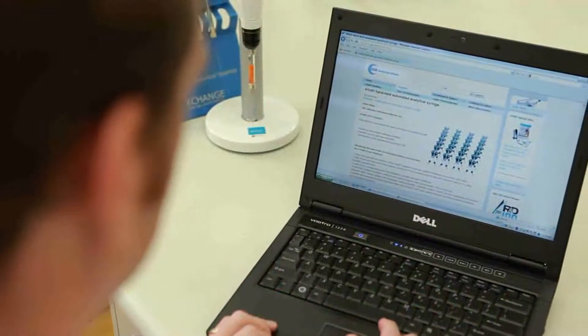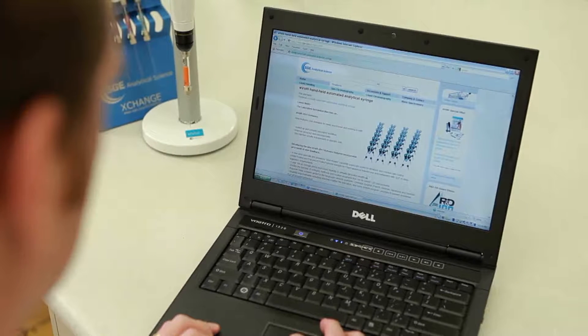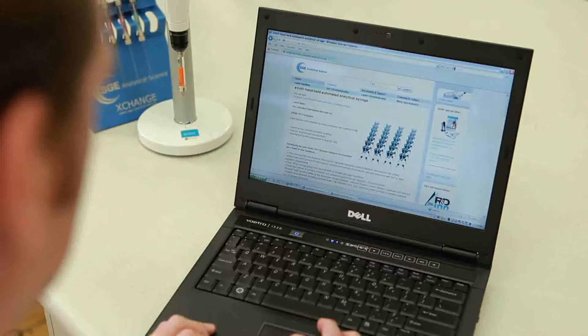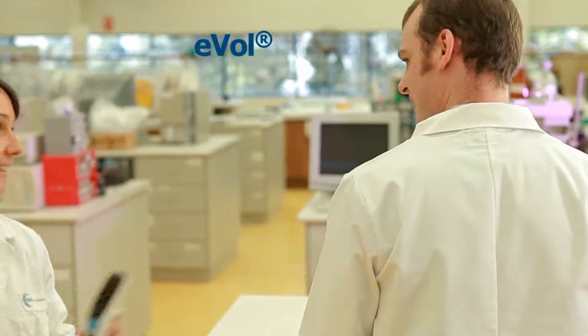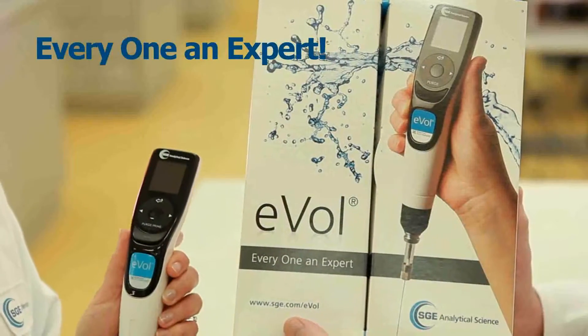Mark thinks it's time he ordered an EVOL of his own, and with the one-year warranty to be free of defects in material or workmanship, it's a risk-free investment in efficiency and quality. The EVOL digital analytical syringe, making everyone an expert in fluid handling.